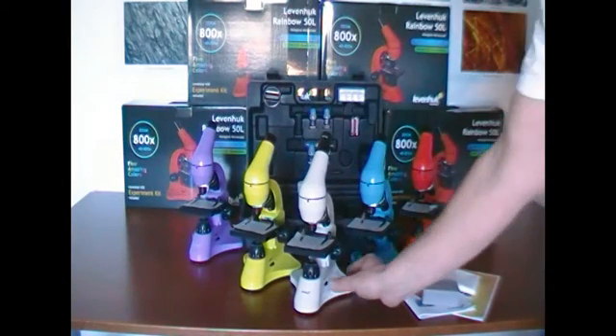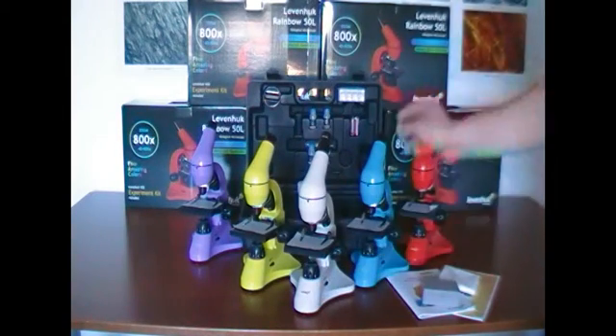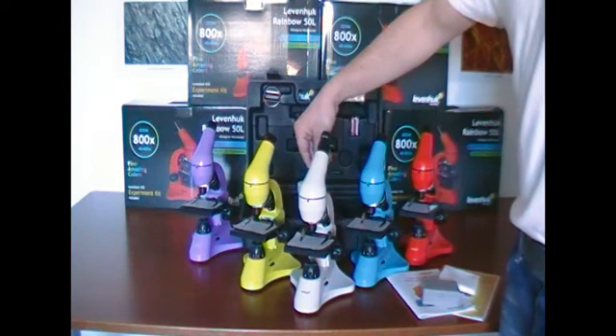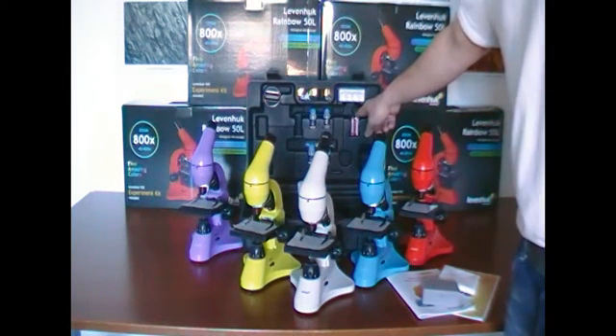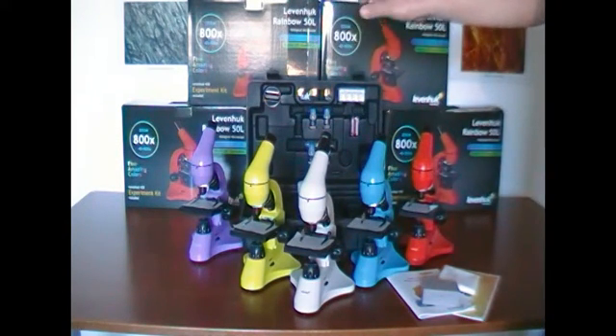Its backlight is both upper and bottom. This microscope is powered either from an AC outlet or by inserting two AA batteries, making it independent of electricity so I can take it wherever I go.